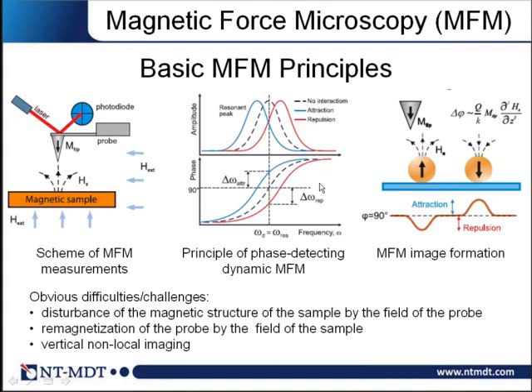However, I can imagine that by measurements in a strong magnetic field, you can get better resolution than by measuring in zero magnetic field, because as soon as you apply a strong magnetic field, you should not take care of possible remagnetization of your state by the dipole fields of the probe. So you can really use probes with thick coating and high magnetic moment materials.